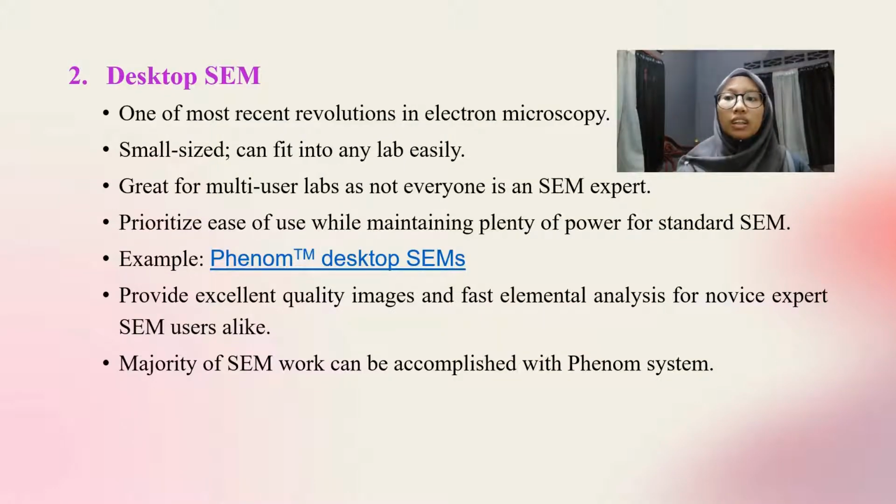Next, we have desktop scanning electron microscope. It is one of the most recent revolutions in electron microscopy. It is small in size and can fit into any lab easily. It is also great for multi-user labs, as not everyone is an SEM expert, or not everyone is familiar with SEM.